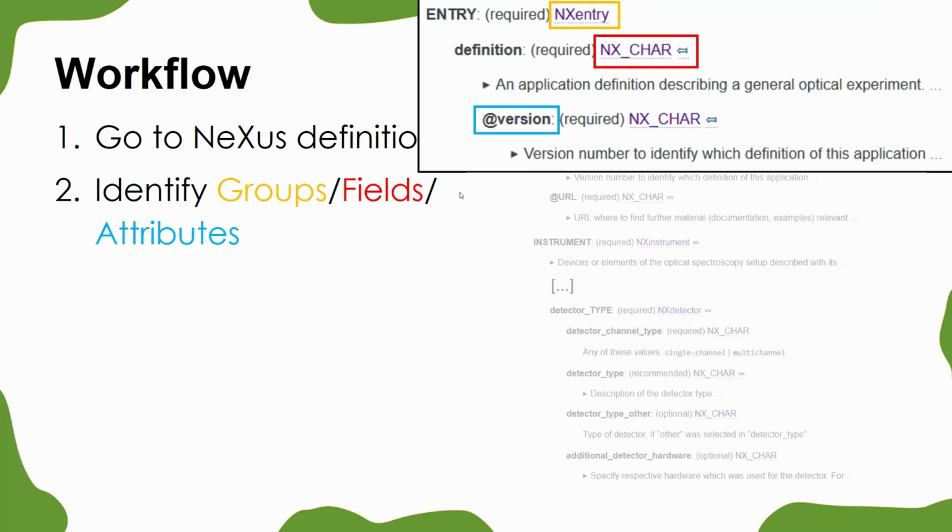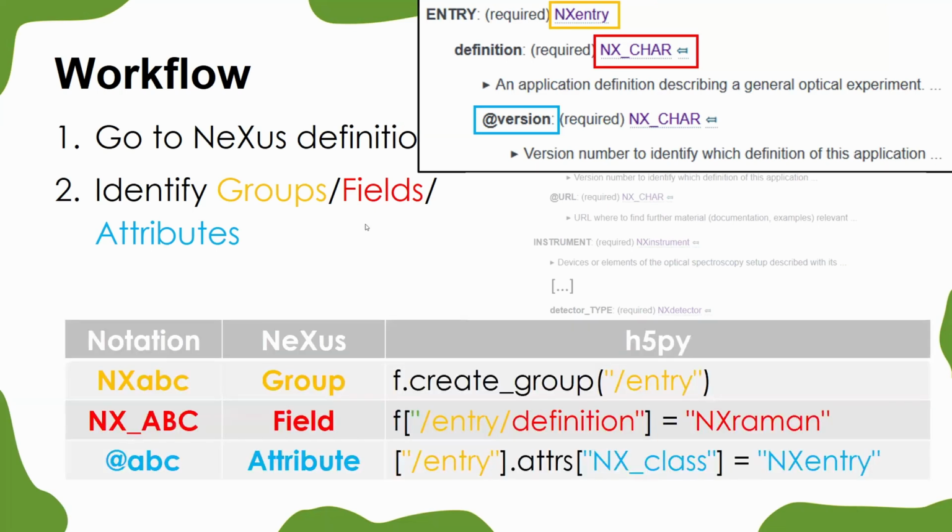Let us take a more detailed look. I'll tell you soon how to do this. For example, here, let us again start with the attribute. The blue thing here, that's the attribute, has an @ symbol in front. You see here the notation, so to say, is @ and then ABC, some letters, a name. This is the command which you use. So here again, the F is missing. I have to correct this.